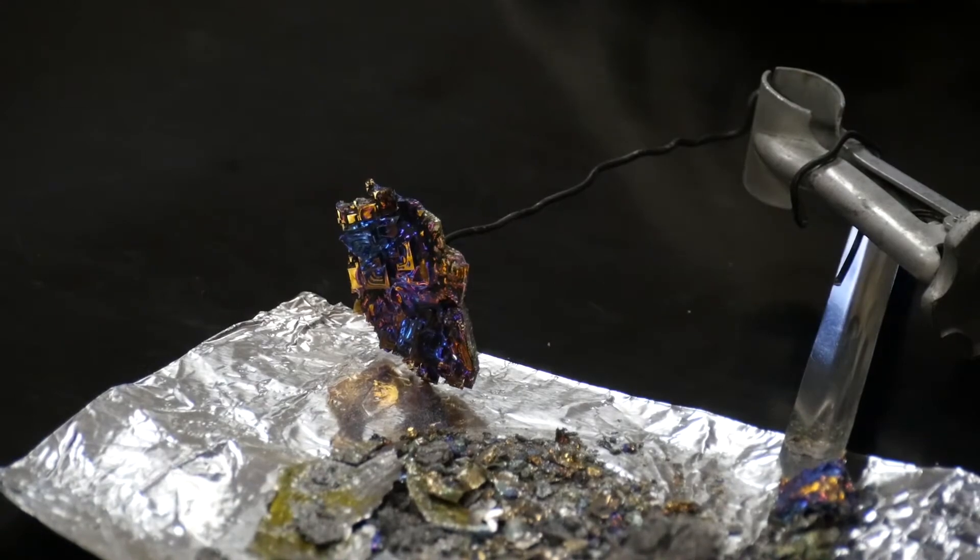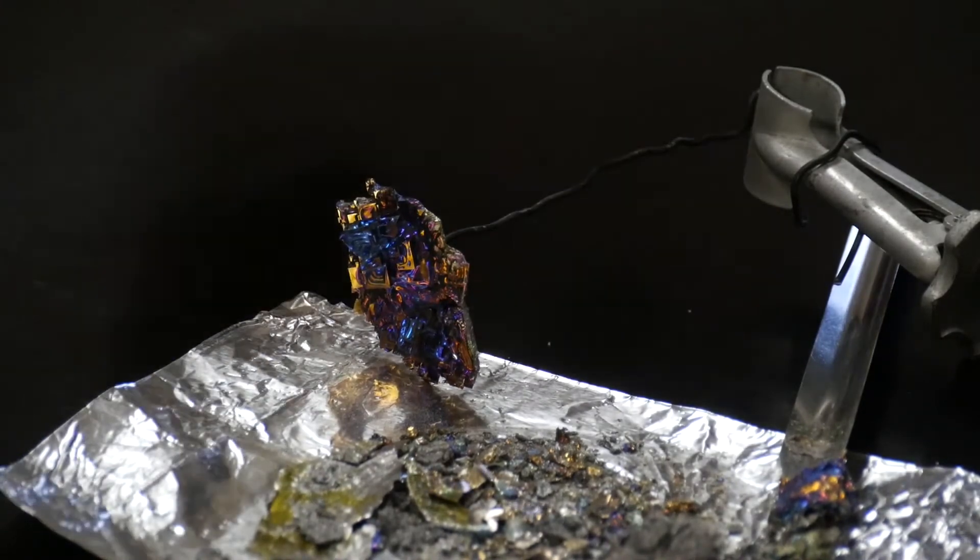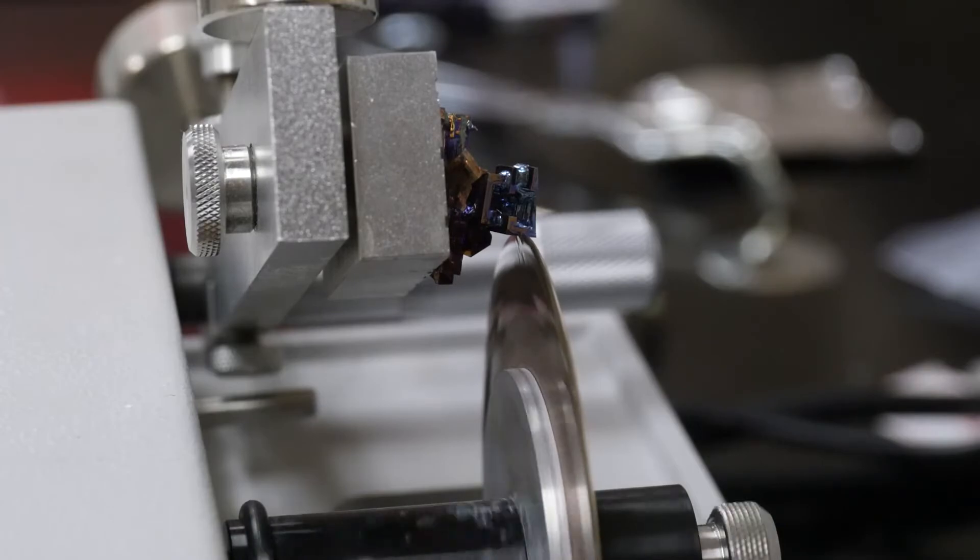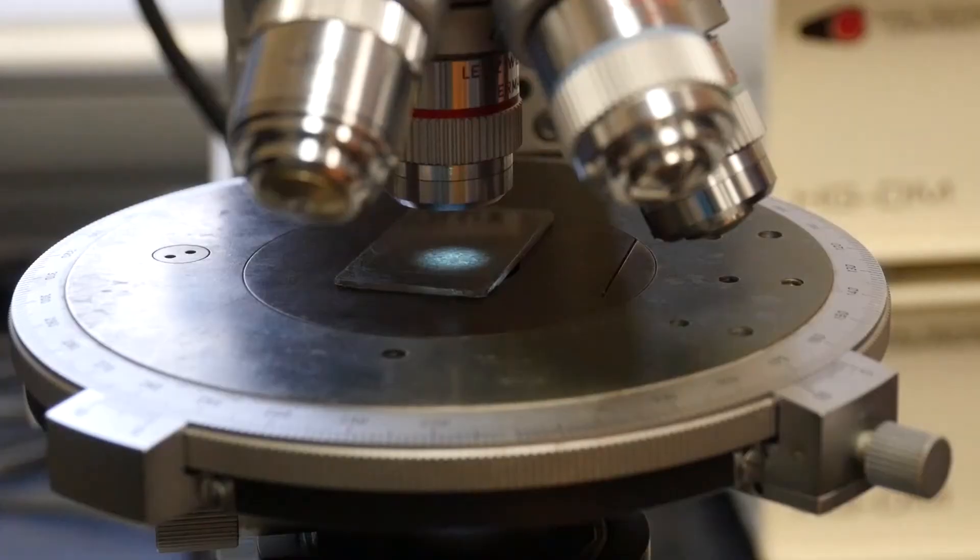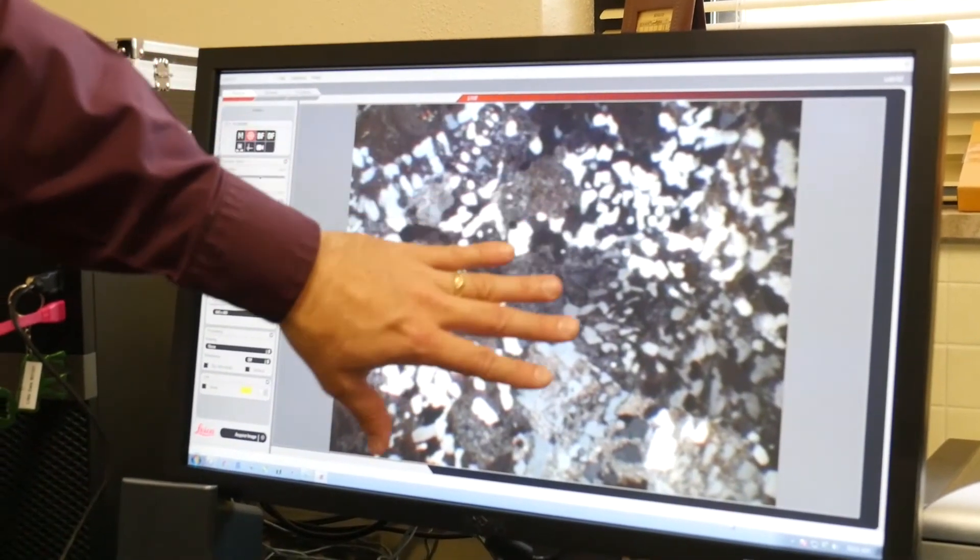And once we get a usable crystal, we will take that crystal over to the slow speed saw, section it, take those sections, scan them into the computer and compare those with pictures of some of the Wichita mountain granite groups that have a certain texture that we're looking for.